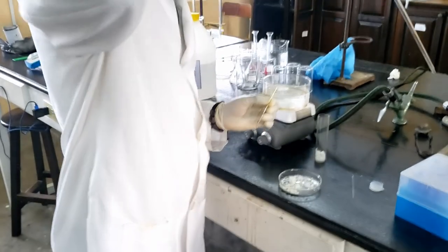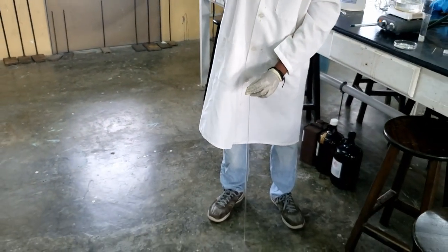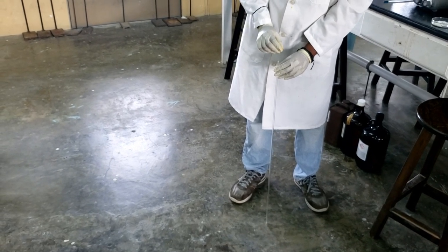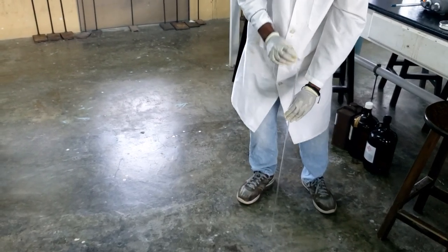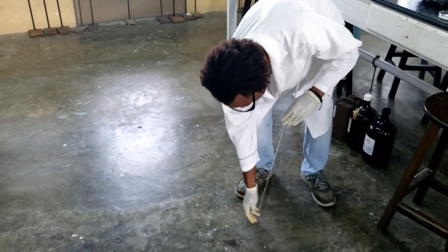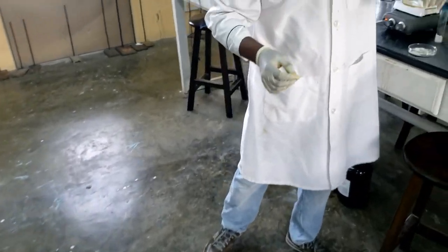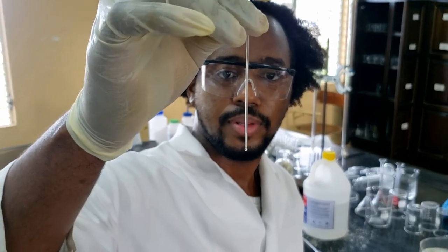And if you take a larger capillary tube, sit on the ground and just drop towards the sealed end, the solid will move to that end of the capillary tube. So we just do that several times till we get that solid out to the bottom. There you go. So with just gravity, we've gotten all of that solid to the bottom of this capillary tube.